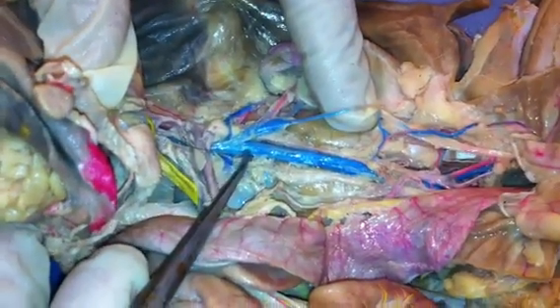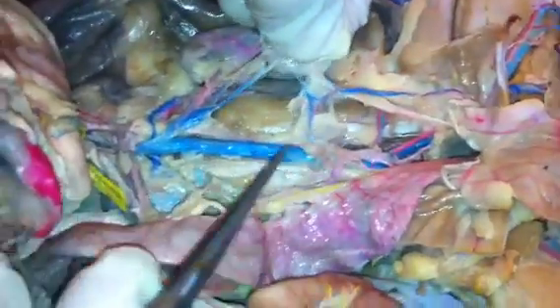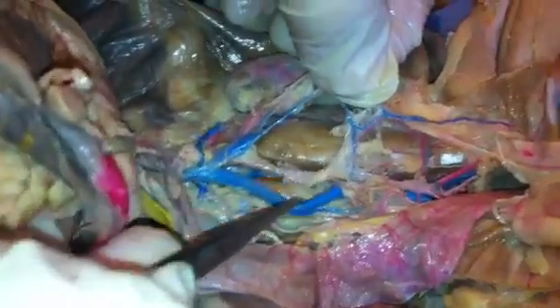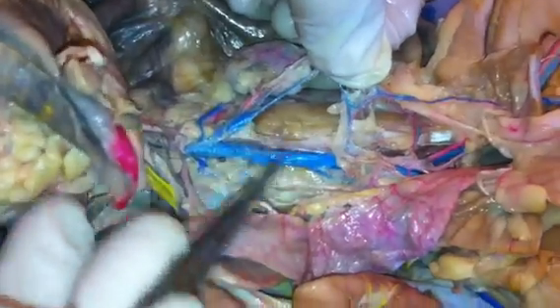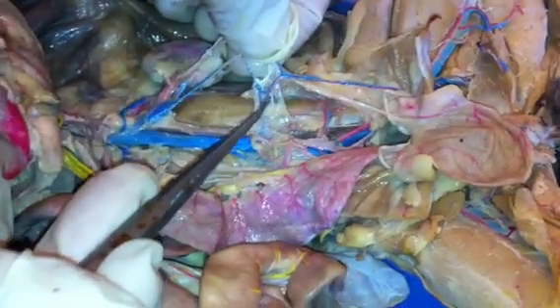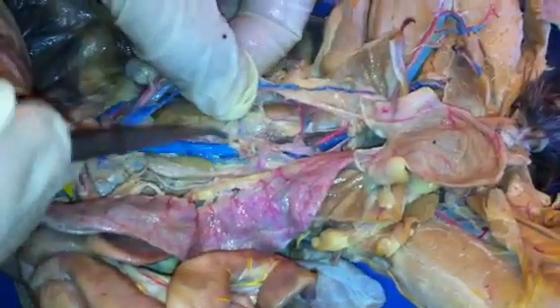cava. Now, in terms of arteries, when I did this testicular vein, I noticed that there was an artery here coming from the aorta. Let's just get the aorta here where we can see it. The abdominal aorta is running on the left side of the inferior vena cava, and the little pink artery that's here comes along and comes right out of the aorta.